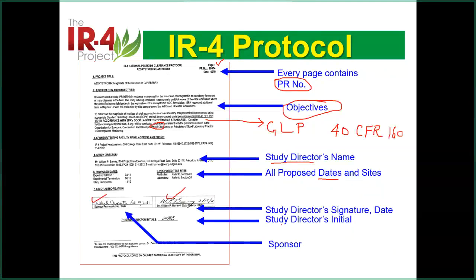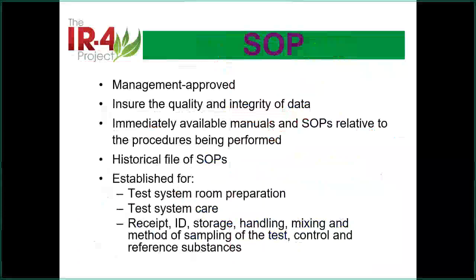So that's the protocol thing. That's the overall. And you pretty much will see this kind of format for all the studies you see. I'm sure we train people this way. Then next we talk about the laboratory, we talk about the SOPs, standard operating procedures.